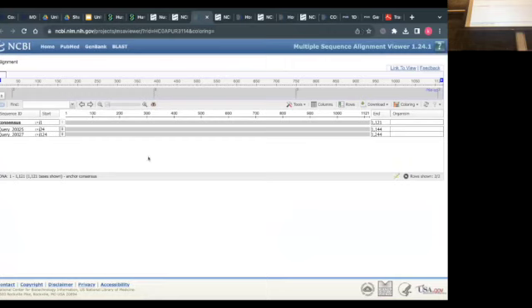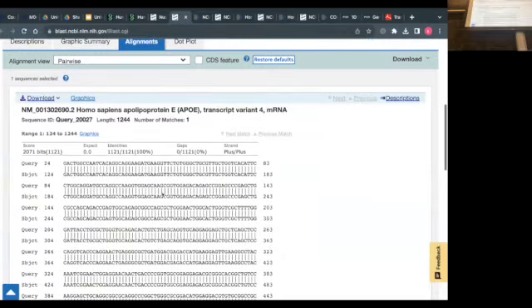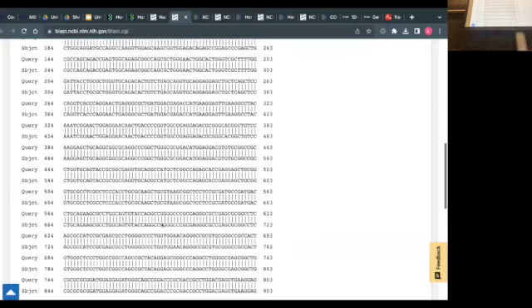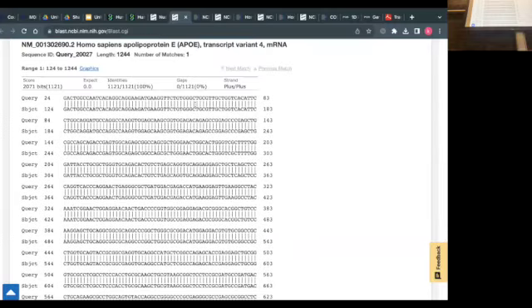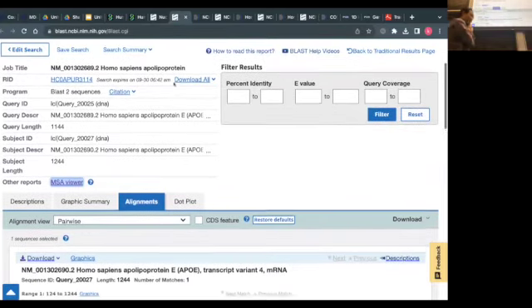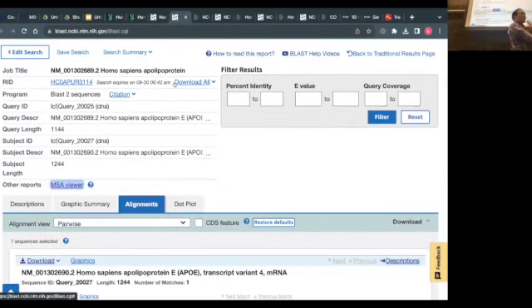So where is the difference? I see. Okay. Good try, but this time you tried to get the transcript sequences and then align those transcript sequences. In principle, this is not a wrong approach.